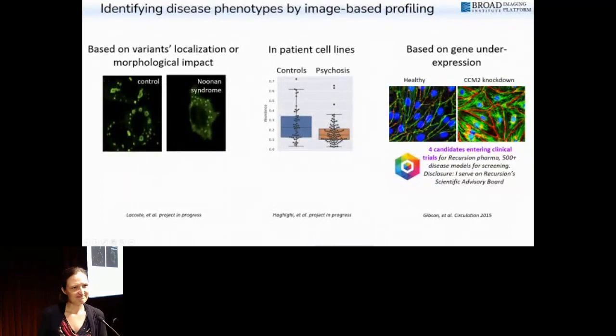And the last one, if you don't understand the mechanism, how can you be confident that reversing the image-based cell phenotype contributes to reversing disease phenotype? It's a potential limitation. Totally fair question. You certainly can't be sure. I don't want to claim that you immediately go from a drug that does the right thing to cells to a patient, because there are so many things going on. What does it do to other cell types that you haven't tested? What does it do to other stains that you have not assessed? So there are still multiple steps from there.